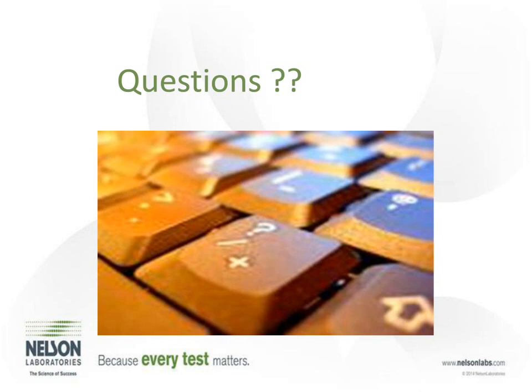Okay, great. Due to time constraints, I do think this will probably be our last question, but we just had tons of really great questions that we weren't able to get to, and again, we will get to them after the fact. So our last question is, for irritation testing, if regulatory submissions are planned for Europe and the U.S., do you recommend performing both the new in vitro test and the standard intracutaneous reactivity?